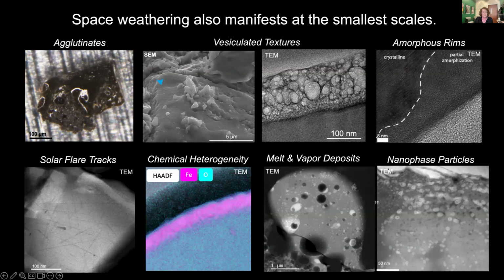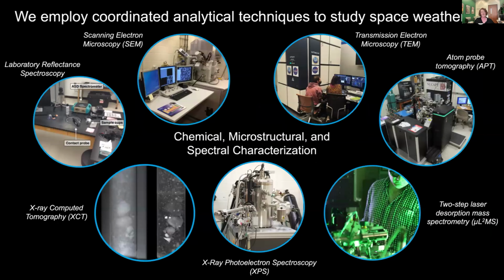So there's a diverse set of characteristics, both microstructural and chemical, that are resulting from this process. And we need to be able to identify them in order to point towards space weathering as what's producing these features rather than them being characteristic of the inherent nature of the sample. So in order to do that, we need to use coordinated analytical techniques. We need to understand chemistry, microstructure, and the optical or spectral characteristics.